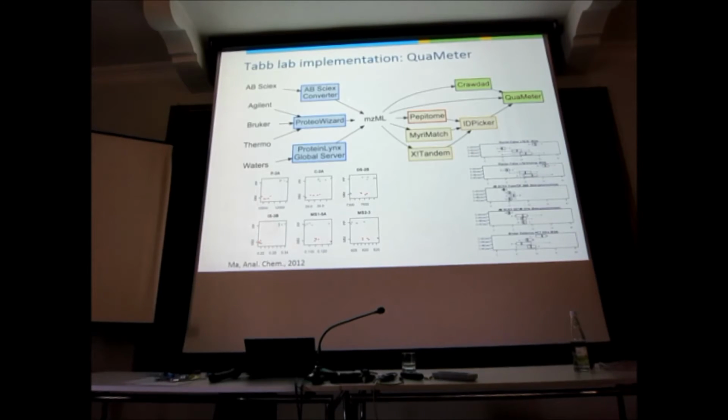Now, let's go into a bit more detail. The problem is, the NIST stuff is hard to run. It's a bunch of Perl scripts that only work if you rotate your computer counterclockwise 7 times at midnight and then sacrifice a black cat. Right? So Dave Tabb then did this QuaMeter implementation, which does everything that the NIST thing does, but it doesn't require the sacrifice of the cat. It does require the turning of the computer, unfortunately, because he has a lot of different tools that you have to somehow glue together. But they're applicable to everything and not just Thermo.